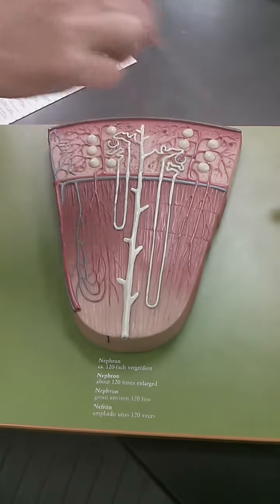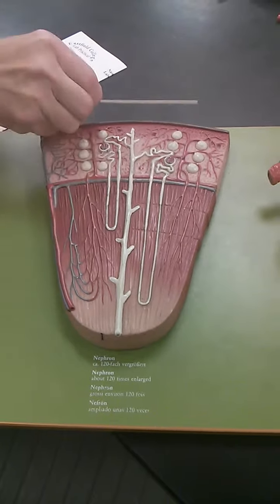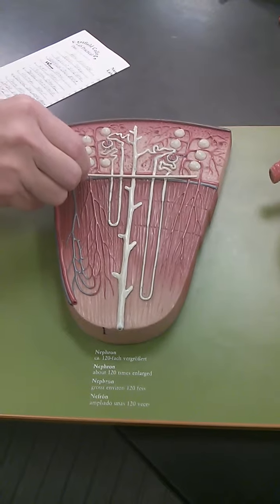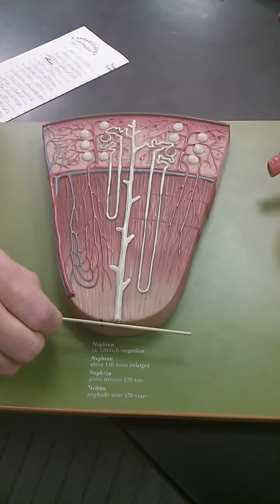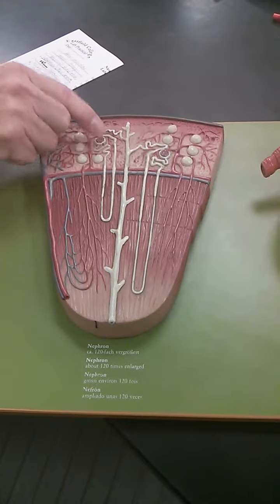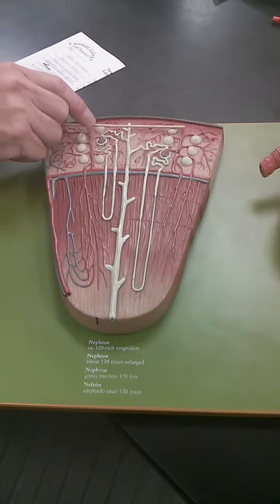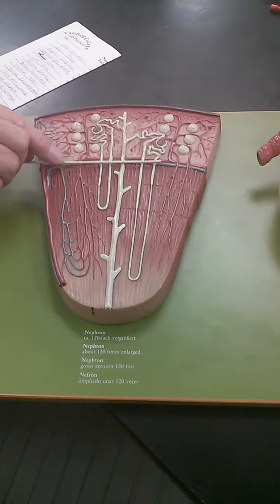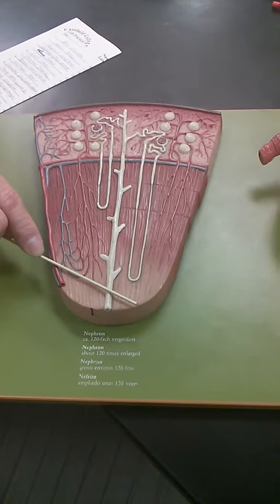This is a pyramid, and from this area to this area, that is the cortex. This, from this area to this point, is the medulla. You'll notice that your glomerulus or nephrons are up here, glomerular capsules are all up here in the cortex, and your loops of Henle and your collecting ducts are down here more in the medulla.